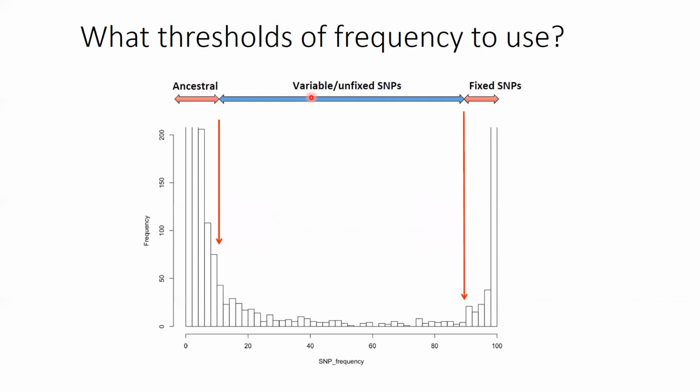Some mutations, in particular if they appear in very low frequencies, might be due to sequencing mistakes and not due to a true mutation in our bacterial population. So in practice, we usually set some arbitrary allele frequency thresholds. Mutations that appear at very low frequencies, let's say from 5 to 10%, we ignore because we cannot distinguish them from sequencing mistakes, and we consider the allele in the reference genome.